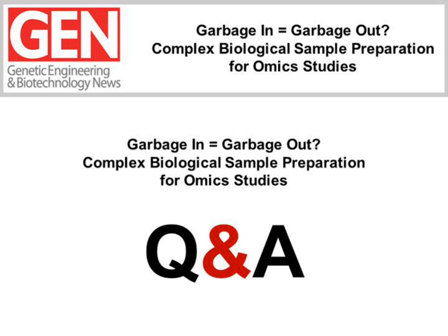Thank you very much. And a question: could you explain a little more about what proteins or samples might be hard to quantify using a Bradford assay? I do think that there is plenty of literature on this subject. I can provide the papers upon request. The problem with the Bradford assay is it is dye-based. The dye is binding to the protein, and Bradford is using Coomassie, which is looking for the amines in the protein.